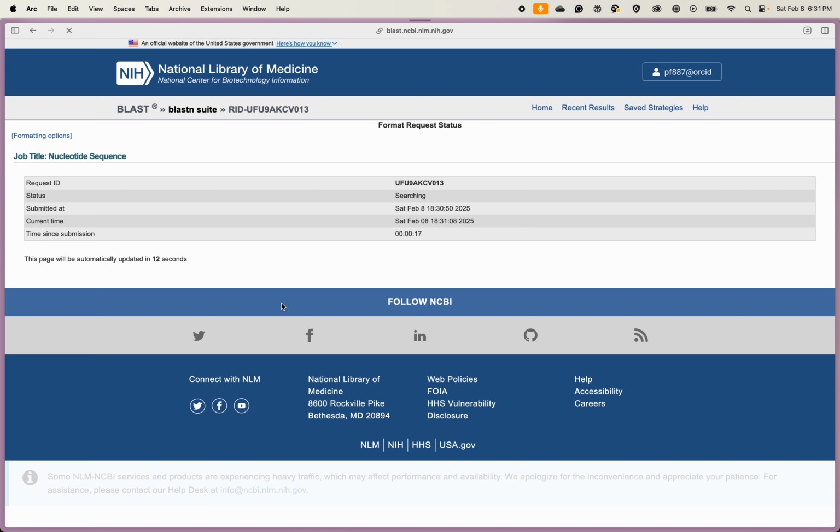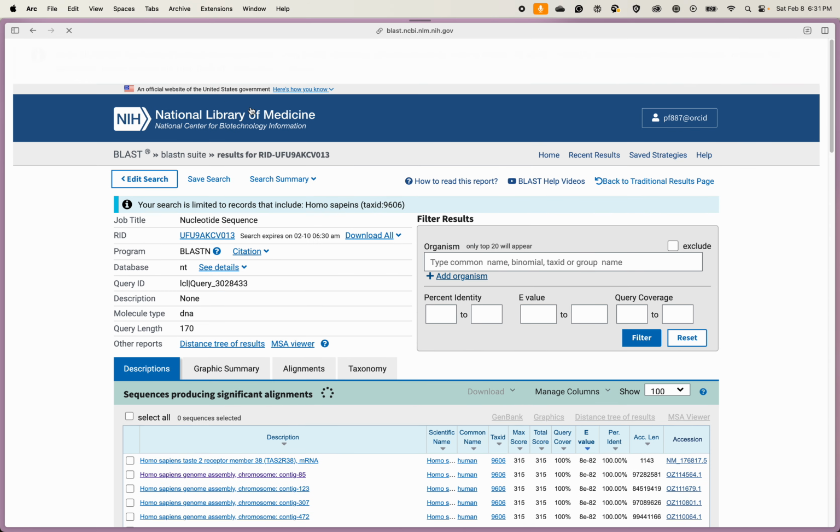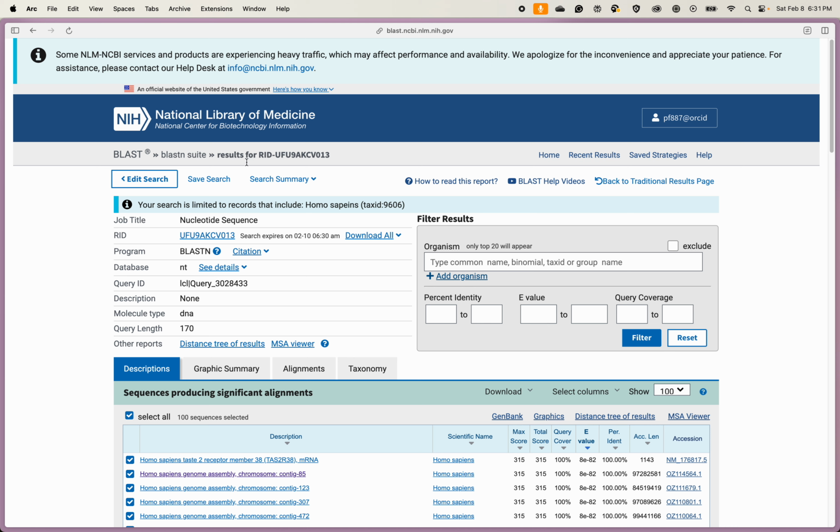But hopefully it doesn't take too long, because this is not a good look for the video length. Okay, so it's taking 12 seconds. It's going to update. Maybe if we hit there it goes. Okay, and then what do we got here?